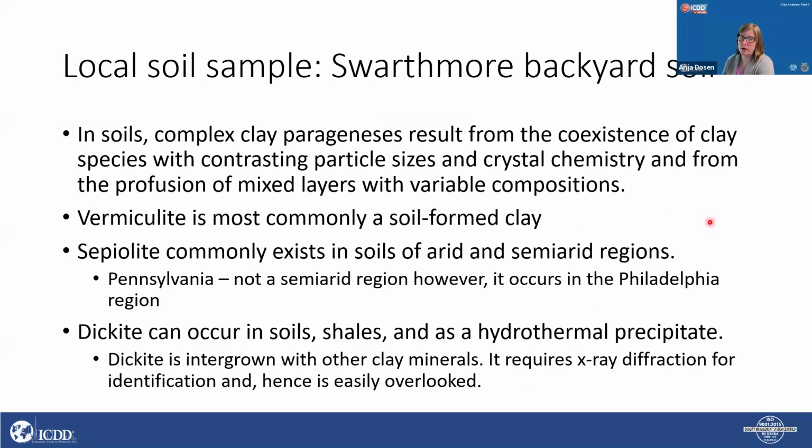The justification is that you have to do some research. You can't just go and, although the accuracy is very high, you have to confirm that these are actually the clays that are possible to be in your sample. So for example, vermiculite is a commonly soil-forming clay. Sepiolite exists in Pennsylvania.